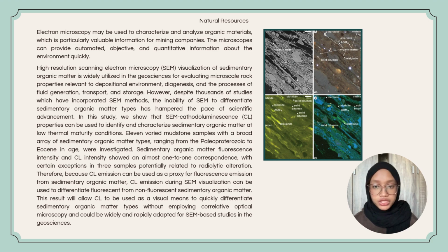In this study, we show that SEM cathodoluminescence properties can be used to identify and characterize sedimentary organic matter at low thermal maturity conditions. Eleven varied mudstone samples with a broad array of sedimentary organic matter types, ranging from the Paleoproterozoic to Eocene in age, were investigated.